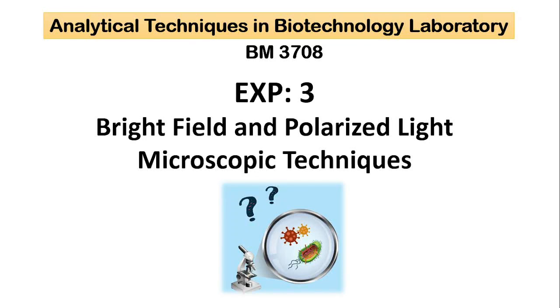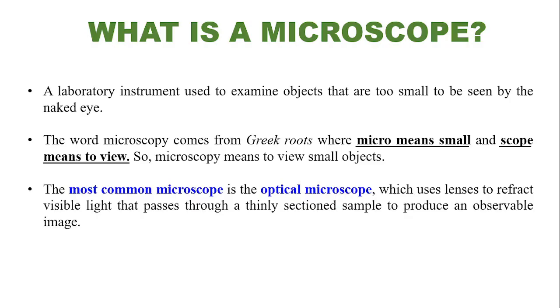Good morning, everyone. Today's experiment is based on bright field and polarized light microscopic techniques. What is a microscope? It is a laboratory instrument used to examine those objects that are not usually visible to the naked eye.